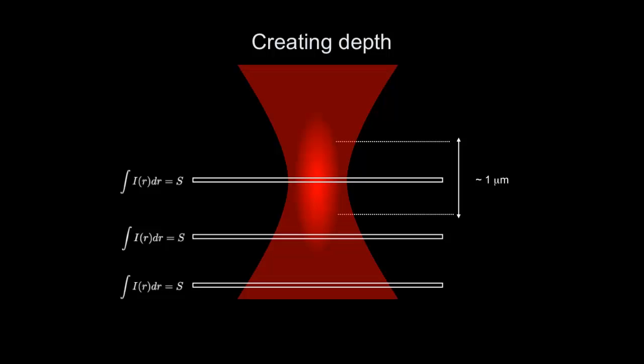Why do I say that? Because this is the basis of the following statement. There's no depth dependence in the total intensity if you do regular light microscopy. If you focus this light into this cone, then at every plane the photons will go through. So that means if you have a signal generating mechanism, for instance like fluorescence or absorption, every plane contributes to your optical effect that you're trying to measure. Okay? You're not exclusively sensitive to what happens here, really. You measure everything that happens in this cone.